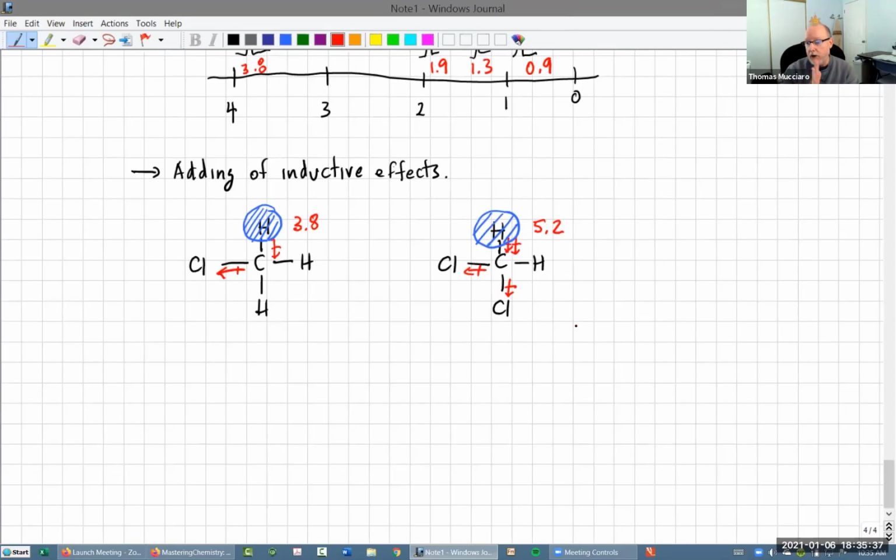When you look at the NMR correlation table, it's going to be telling you the general rule, like if you have a thing pulling, it's approximately here. But a lot of tables, and in fact, my basic table, doesn't account for what happens if I have 2 chlorines pulling, right? It doesn't account for the fact that these add up.